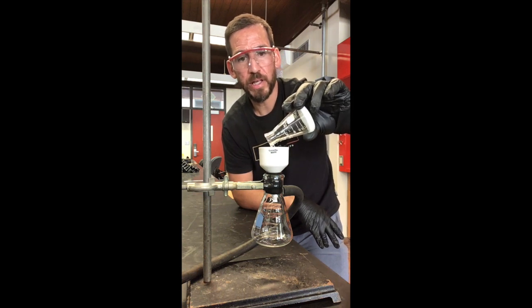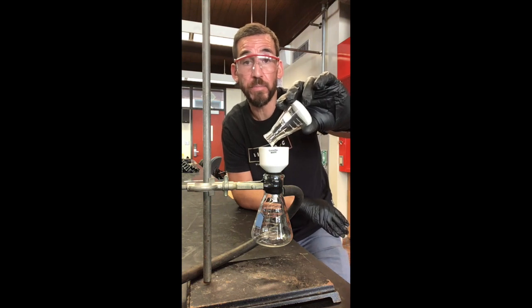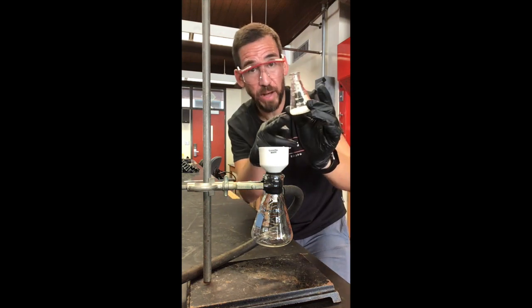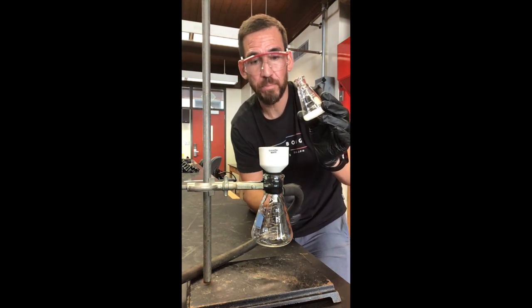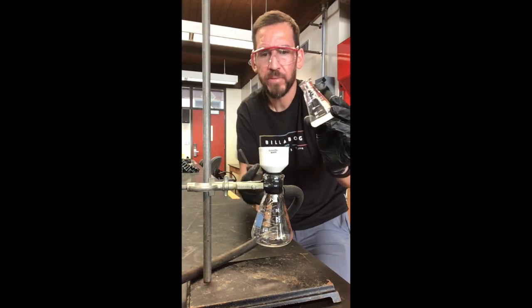And so this is something that you can easily do at home to separate your solid material from your liquid material. You're going to have to be careful because it's not always going to be stuck at the bottom like it was for caffeine. I just made that for an easy example of decanting. Perfect. I totally planned that, by the way.